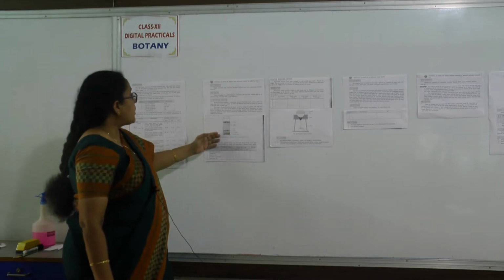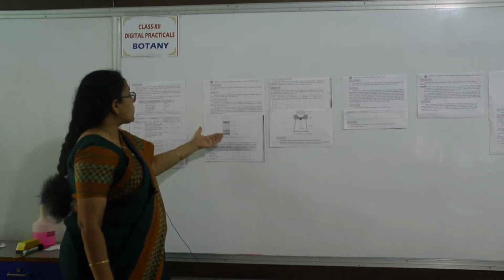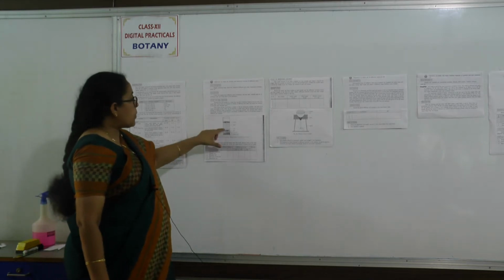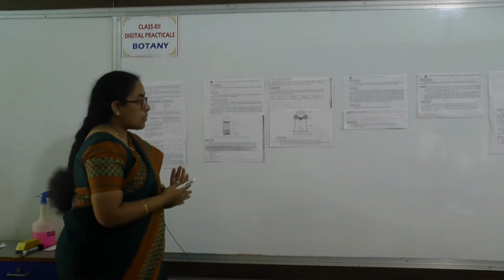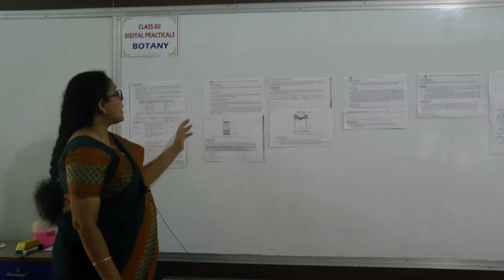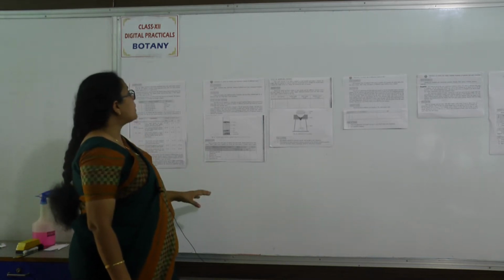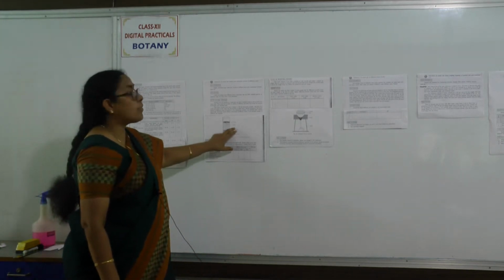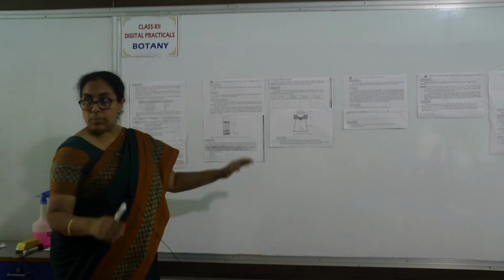So mom will explain you about the experiment. You will have to take the soil and put it in water, and we will have to take the measuring cylinder. You will have to add the water and the soil in it, and leave it like this, where you will find out the different forms of the soil available here.